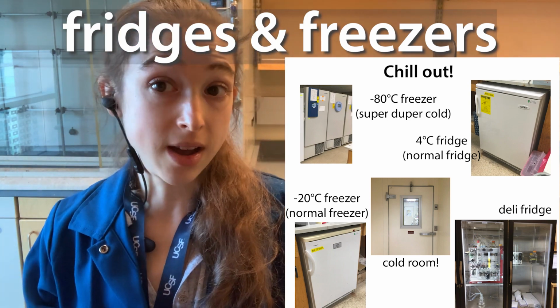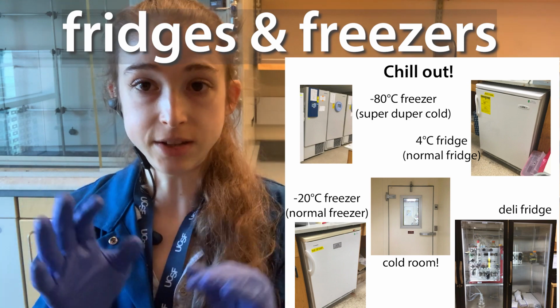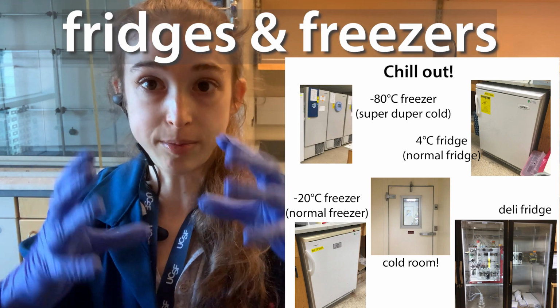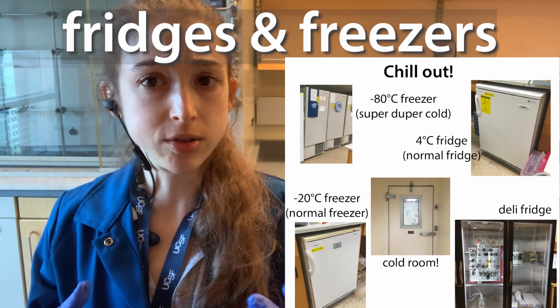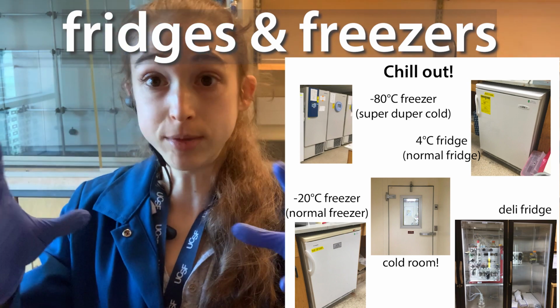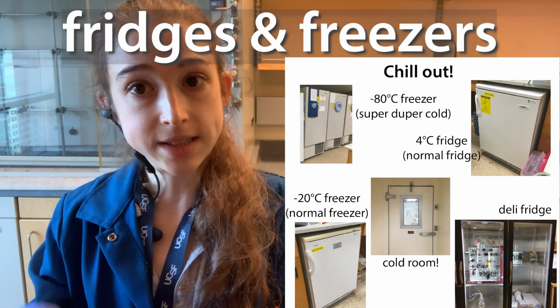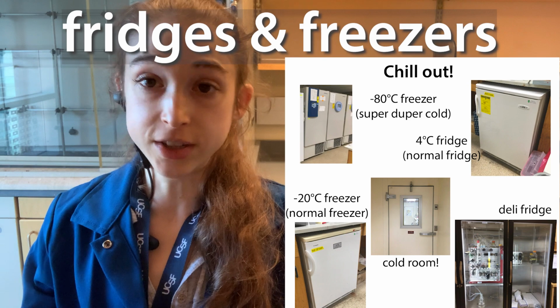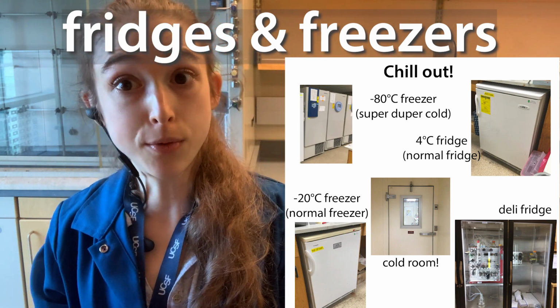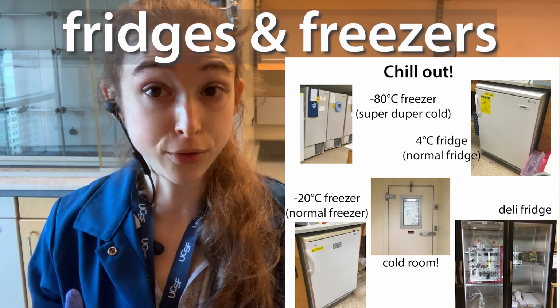For fridges, we also have deli fridges, and these have sliding doors, which is nice, and you can see things, and we often use these if we have big pieces of equipment. Things like protein purification machines, like ÄKTAs, which are these big machines, and we need to keep them cold often when we're doing a protein purification, so we can stick them in one of these deli fridges. And this is really nice because it avoids you having to use the cold room. And so the cold room is basically just like a walk-in fridge.